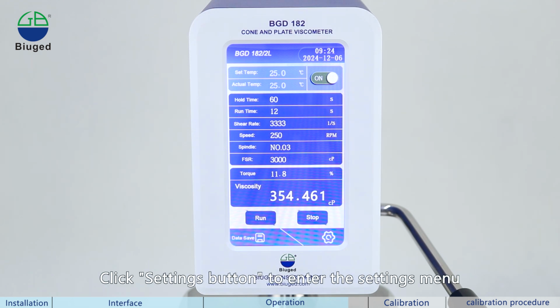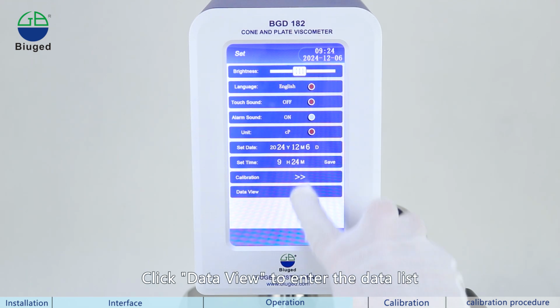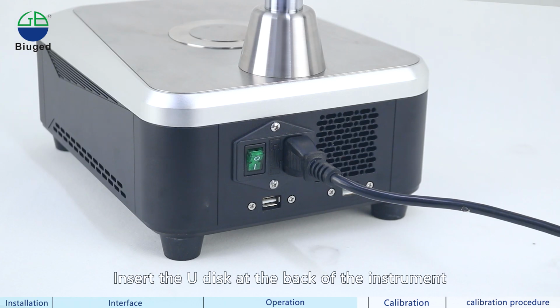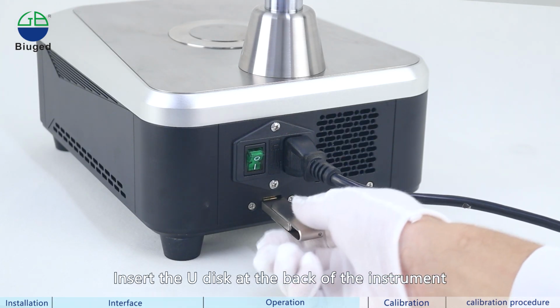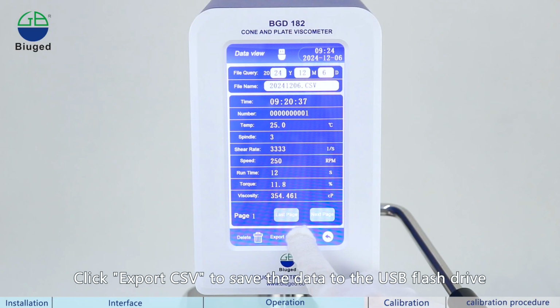Click the Settings button to enter the settings menu. Click Data View to enter the data list. Select the data to be saved. Insert the U-disk at the back of the instrument. Click Export CSV to save the data to the USB flash drive.